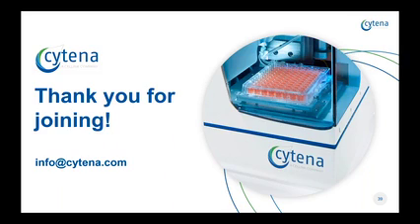How long does it take to dispense into the plates, and which formats are possible? That's also a good question. So, all our instruments support SBS plate format, and by default we are able to dispense into 96 well plates or 384 well plates.